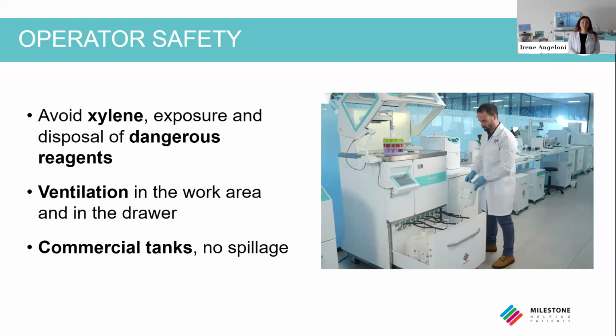And again, this is important regarding the safety of the operator. Of course, it's essential to have also the area where you change the reagent and the area where you work vented to protect again the technician. So this was regarding the operator safety that is very important.